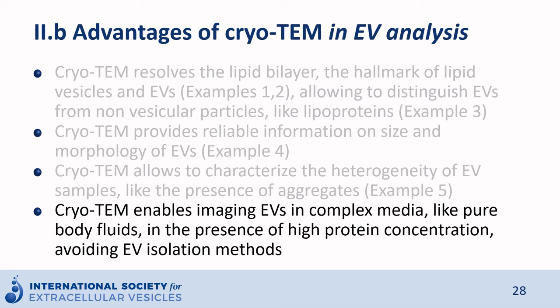A major advantage of cryo-TEM is to enable imaging EVs in complex media, like pure body fluids, as we've just seen, in the presence of high protein concentration, avoiding EV isolation methods like ultracentrifugation, size exclusion chromatography, or filtration, methods which are prone to induce various types of structural damage to EVs.